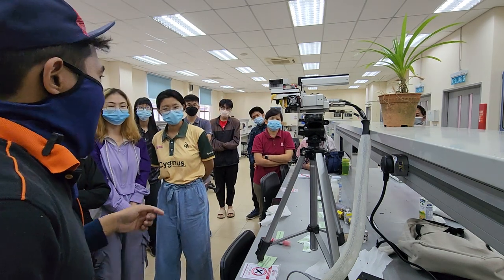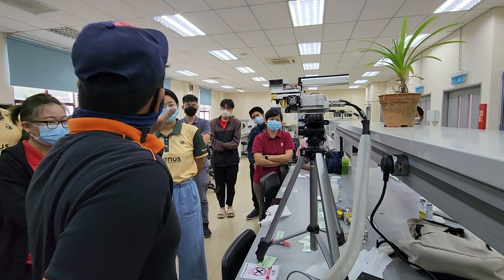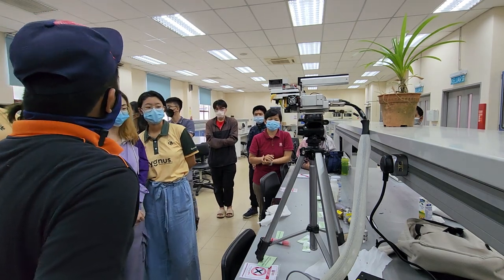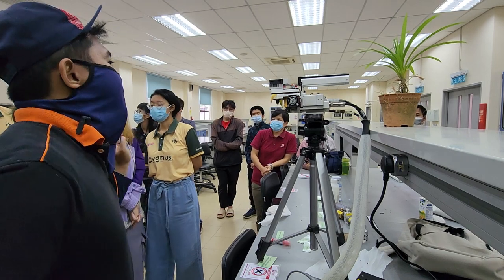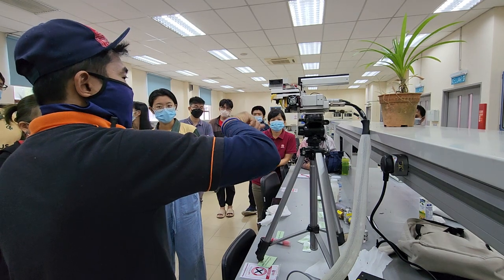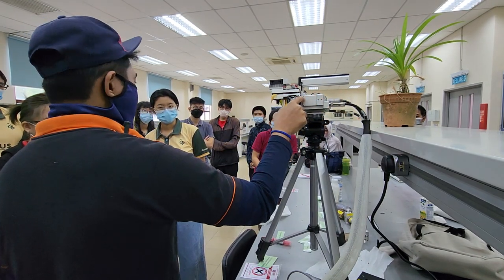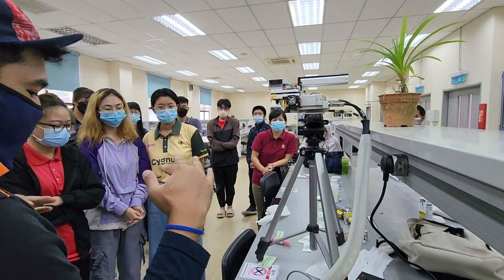If the plant is alive and actively photosynthesizing, the CO2 now will be used. For what? Fixation phase of the Calvin cycle, because that thing consumes CO2. So whatever the plant has not used will be returned back. There is a sensor in here actually. The sensor is going to read, then it will tell the delta CO2, the difference of CO2. Okay?